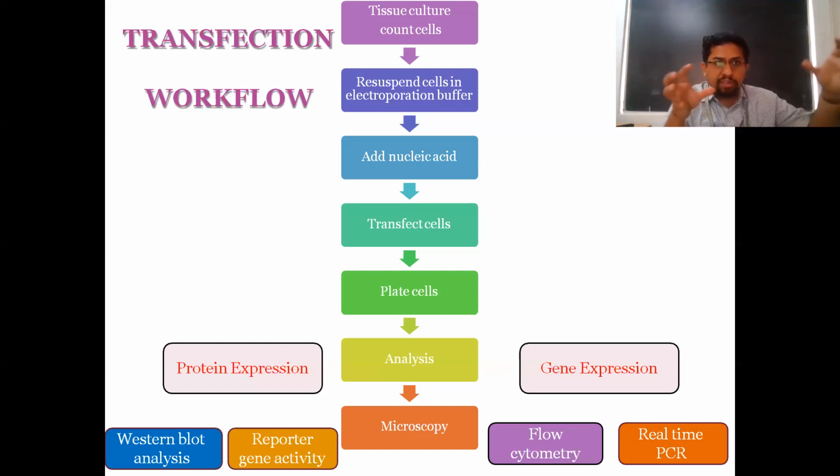You can sort the cells into different compartments, because the flow cytometer will give a certain charge to these antibodies and it will get them segregated. So if you get a good population of cells, you can find that yes, out of this entire transfected population, 10% of these cells have my gene of interest.